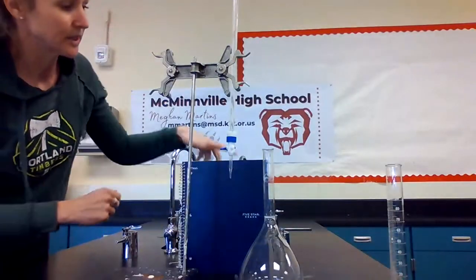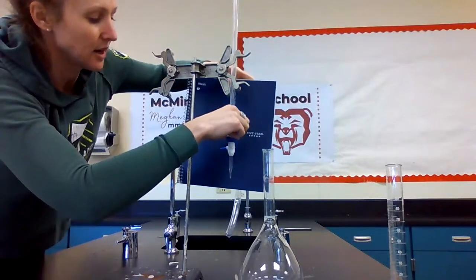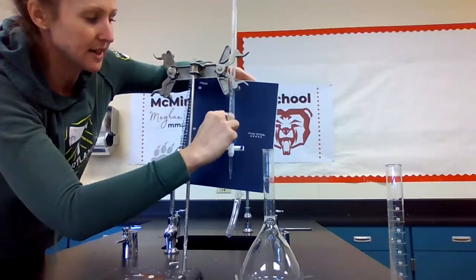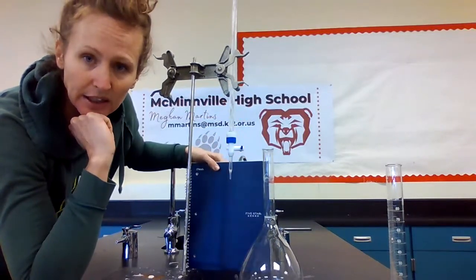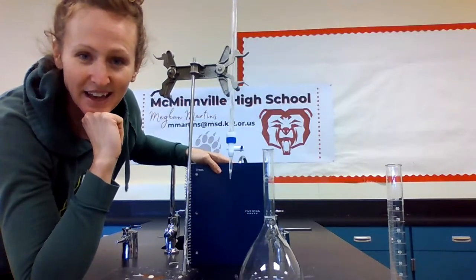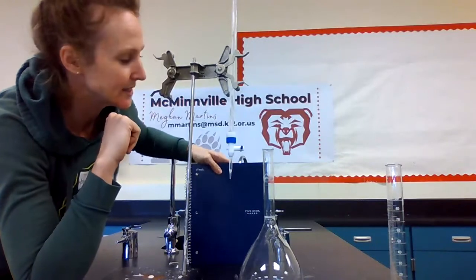Okay, the next thing I want to show you is called a burette, and hopefully you can see our burette here. Our burette also has markings here, and it's used for a very similar reason to the graduated cylinder. It's used for measuring things. Now, you would not ever mix something inside a burette. Don't ever try and do that. It mixes even worse than the graduated cylinder.